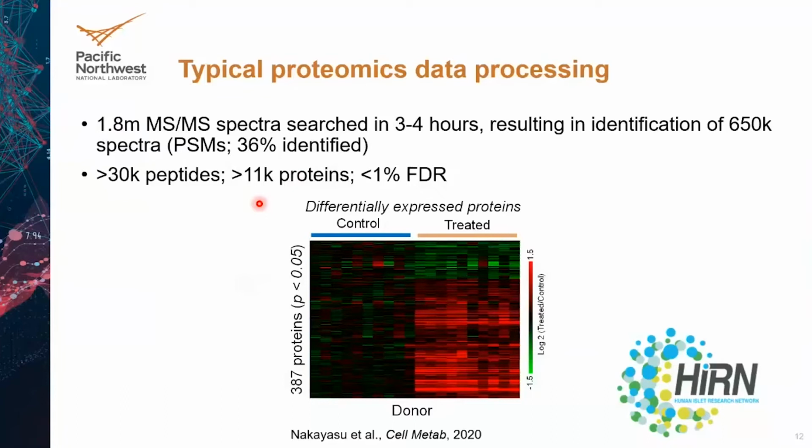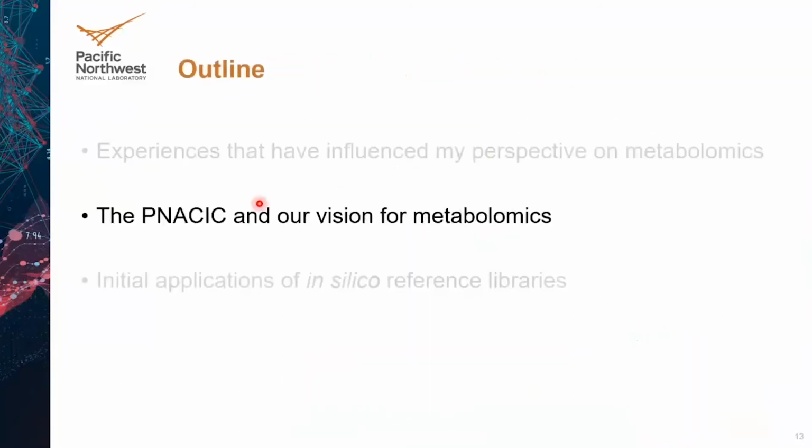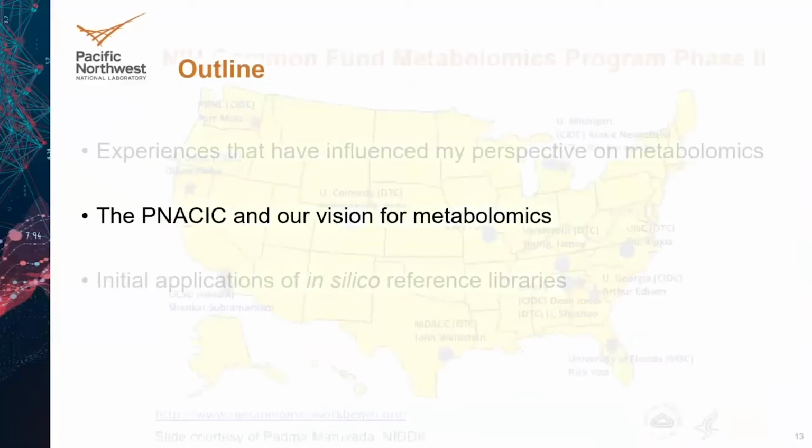We generate our data and we spend a lot of time going through and curating the data to make sure that we're not making misidentifications. So this leads me into our core project that Krista mentioned and what our vision is for the future of metabolomics. I truly believe that relatively soon we're going to get there as a community, but I'll tell the story and we can discuss it later.